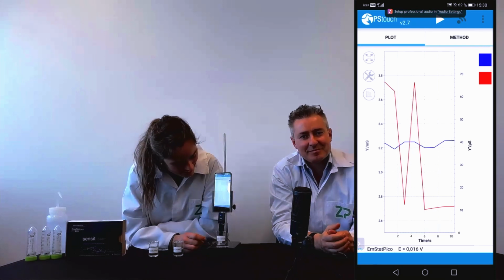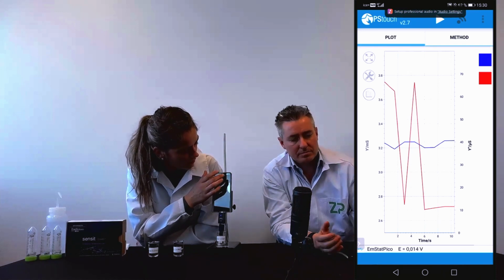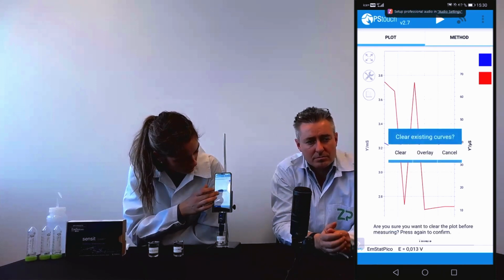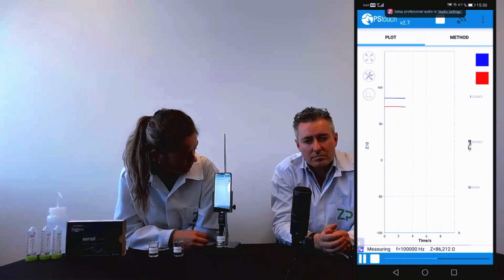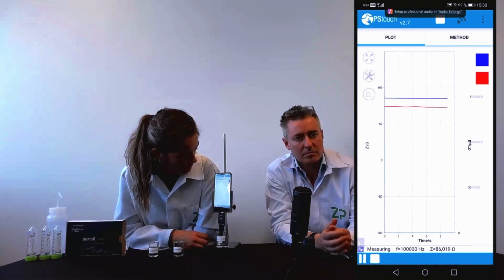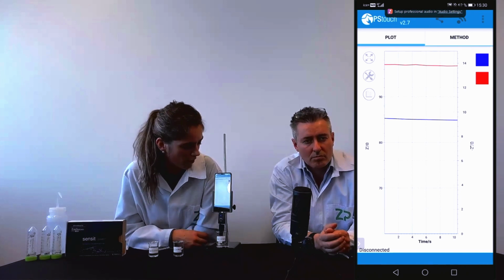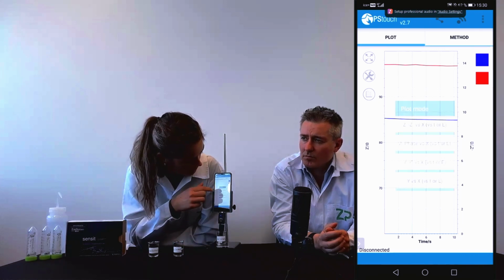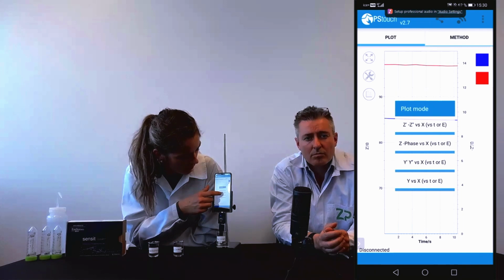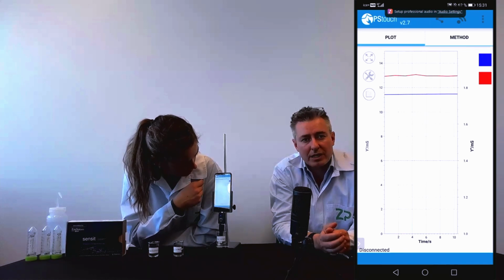No pressure. So here the concentration of the sodium chloride is 42 millimolar, and again we'll run the impedance spectroscopy, and we're running it for 10 seconds yet again. So it's quite fast, and you can deal with quite a lot of different parameters. We're using 5, the DC is 5 millivolts right now, but you can also go for 50 depending on what kind of solution you have. You could always optimize the excitation to get the highest strength signal.